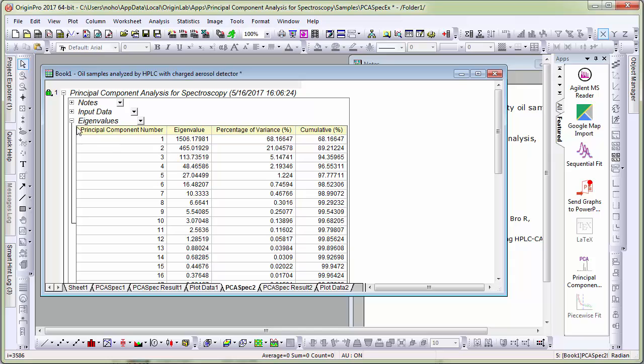One key table is the eigenvalue table which shows how many principal components listed on the first column and the cumulative percentage of how well the data is described. By the time you get to 2 components, 89% of the data is already described.